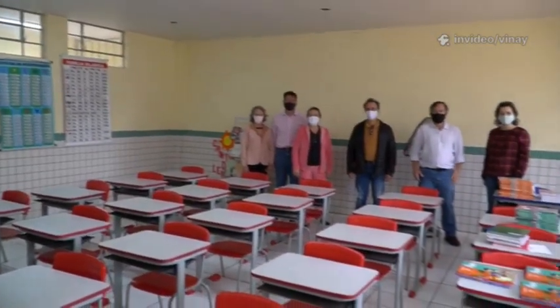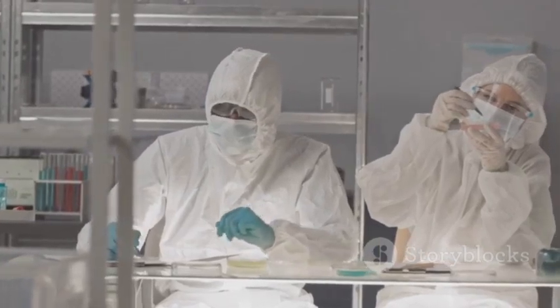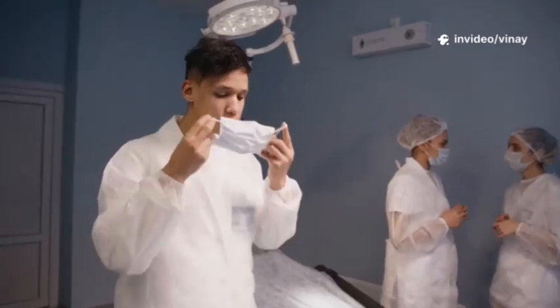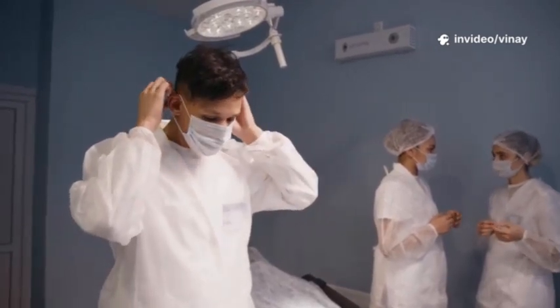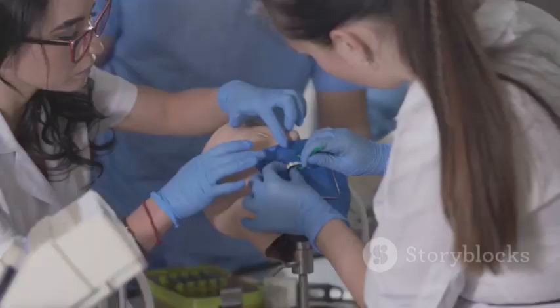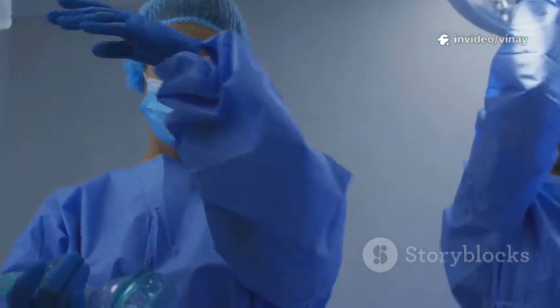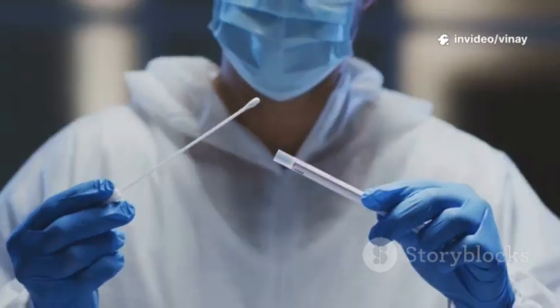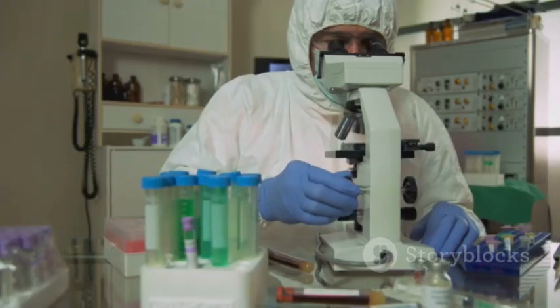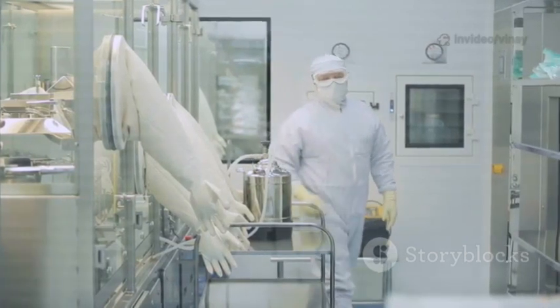The initial training program for a new operator is intensive. It covers basic cleanroom theory, hygiene practices, the proper way to clean and disinfect surfaces, and most importantly, the complex techniques of aseptic gowning. After classroom instruction, trainees undergo hands-on practice, often in a simulated environment, until they can demonstrate proficiency. Aseptic gowning qualification is a formal process where trainees must successfully gown and then have their gloved fingertips and suit sampled for microorganisms. They must pass with results below a predefined limit before they are ever allowed to enter the actual aseptic manufacturing suite.